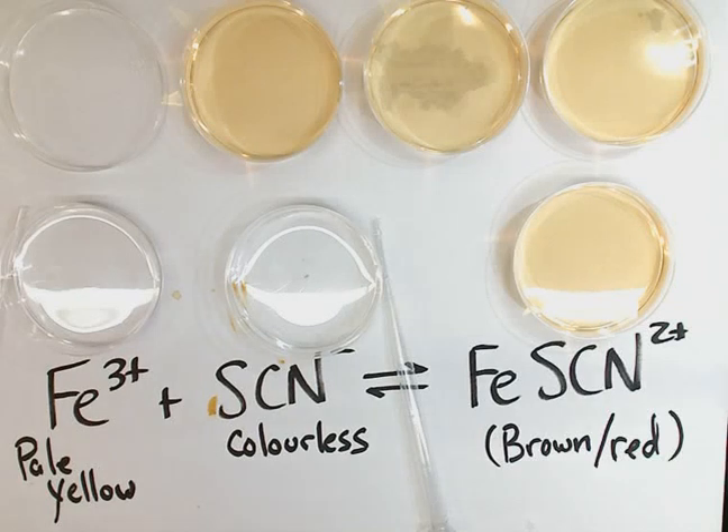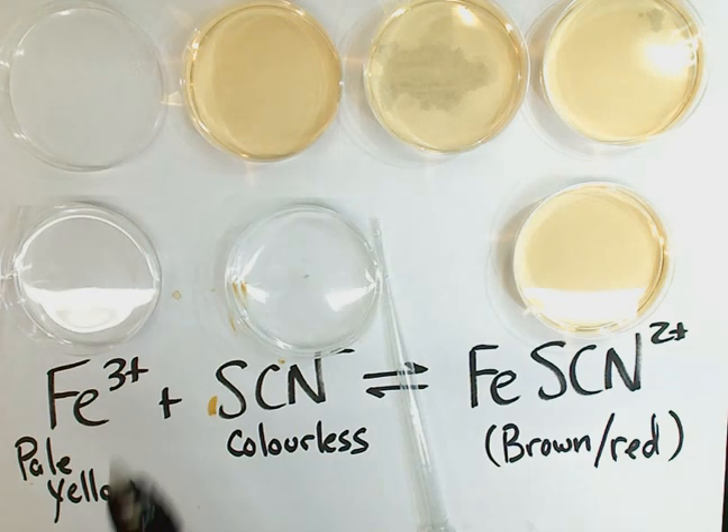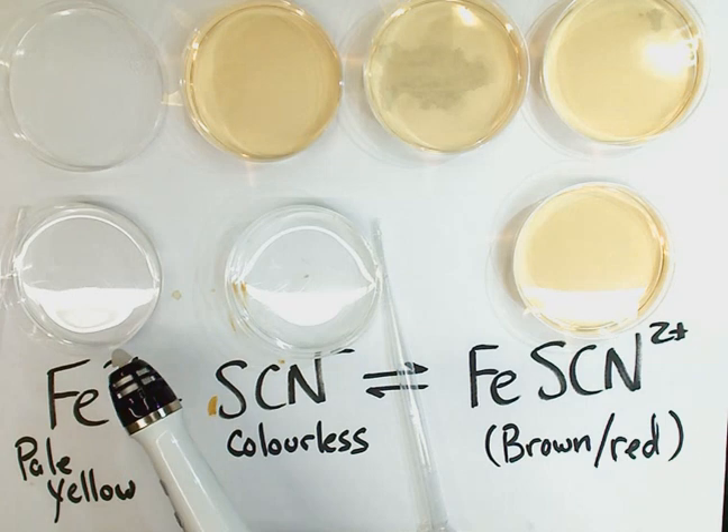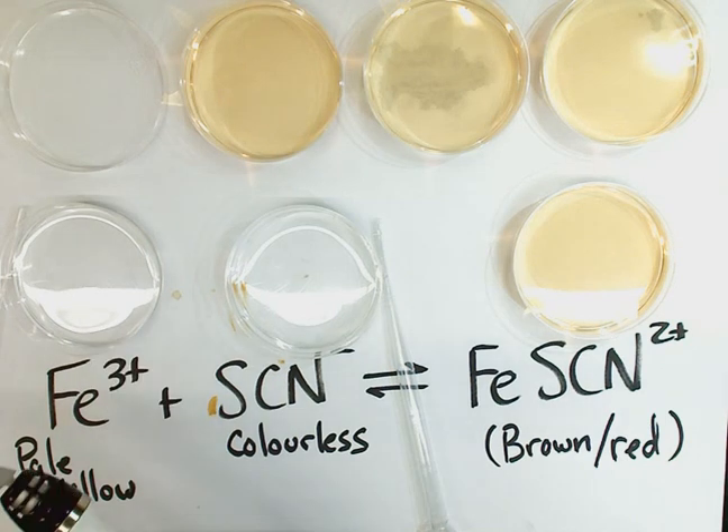Here we are, looking at the equilibrium between iron 3+, from iron 3 nitrate. It's a pale yellow compound, but dissolved in water at this concentration it appears almost colorless. We also have, right beside it, a solution of potassium thiocyanate, which contains the SCN⁻ ion. It is also a colorless-looking compound.